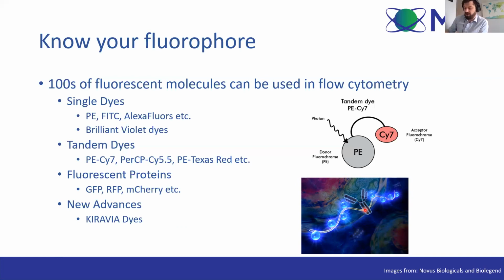And this can be really useful for detecting very weakly expressed or very rare markers, like a very rare cell surface receptor that might be changed by a small amount on a cell after treatment, or maybe an intracellular transcription factor or something like that. So these are really cool, and they're kind of a new technology that's coming along, developed by Sony.